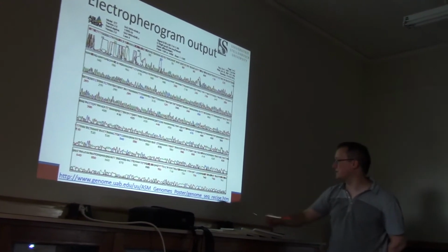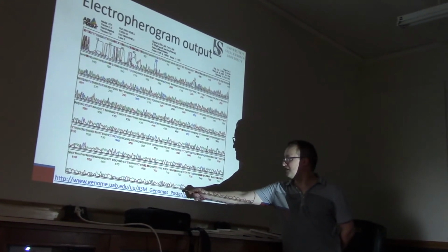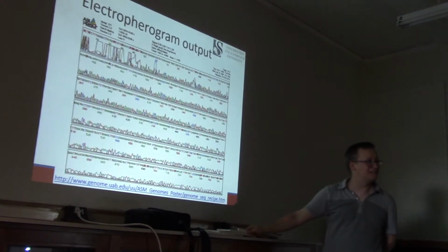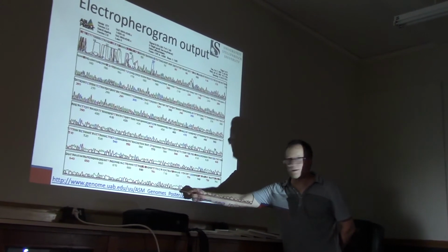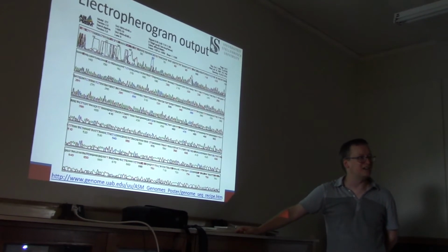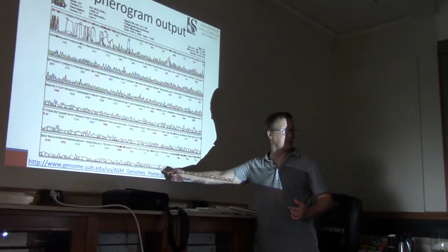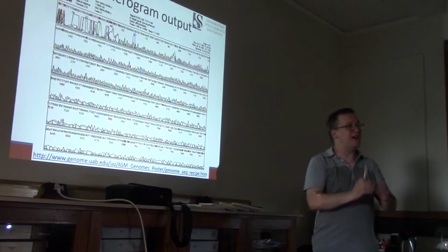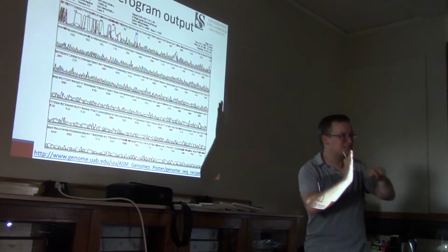I pointed at 450 because this region looks pretty good, right? But what happens when I slide to, say, this region at 720? Do you see nice and sharply defined peaks? How many A's does this long stretch, this long plateau of green constitute? Is that 4 A's? Is that 5 A's? Is it 3? We no longer have good resolution, do we, to say this peak is separate from this peak and so on.